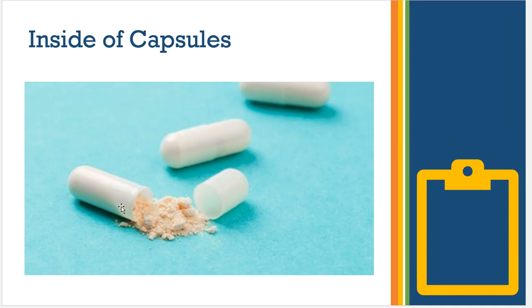This allows us to measure just the contents on the inside of that capsule, because if those contents don't have a variation or they pass the variation, then we're good. And that means the capsule is what led to the first part to fail.